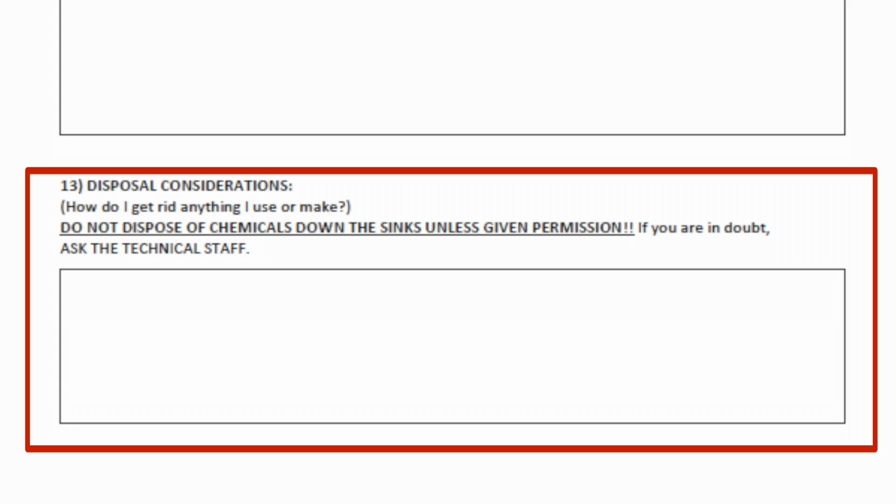What do I do to get rid of it? Okay, I've come to the end of this particular set of experiments, or even my project itself, and I've got a cupboard full of chemicals. What do I do? Well, the first thing you don't do is tip them down the sink. There was a time a lot of chemicals went down the sink, but that's all changed. You can't do that anymore.